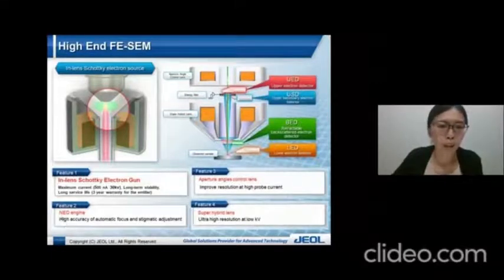There is this new electro-optic control system in the SEM that can provide the highest level of automation, like autofocus, auto stigma, and auto beam alignment. This makes the SEM easier to operate, especially for beginners. The high accuracy of automation also benefits 3D auto acquisition.